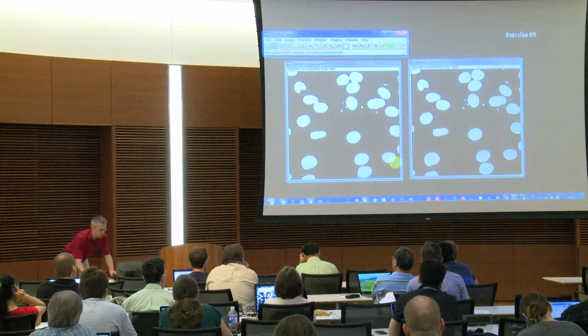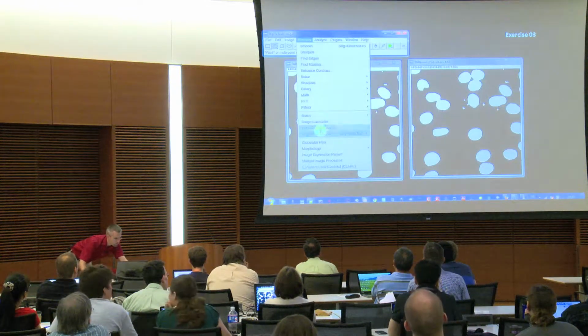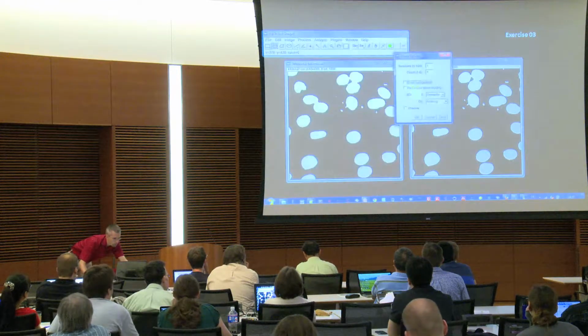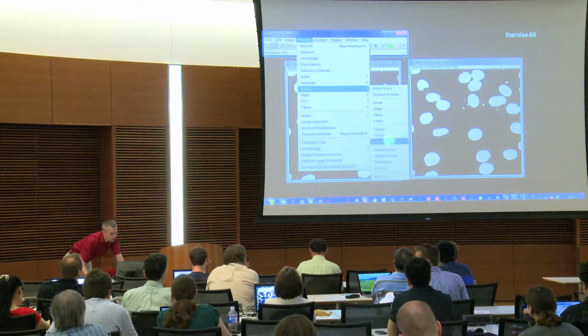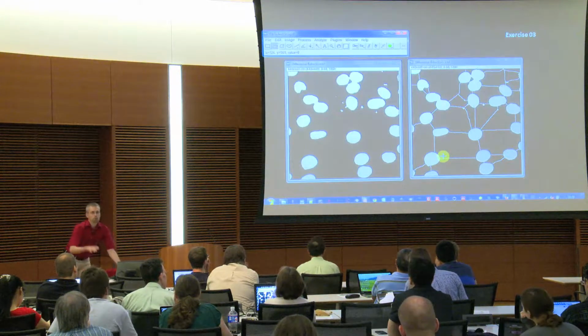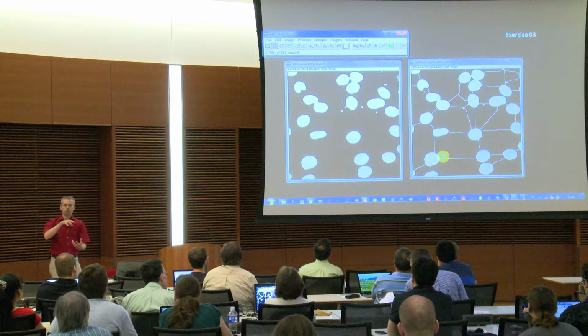If anybody gets a strange result, I can reproduce that here quickly, so that everybody sees what I mean. If black background would not be active because any plugin or whatever switches it off, if you then go to watershed, then you get something like that. Because now the computer thinks black is interesting and the particles, and it separates the black particles from each other.